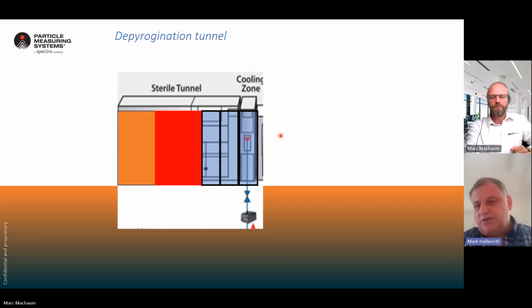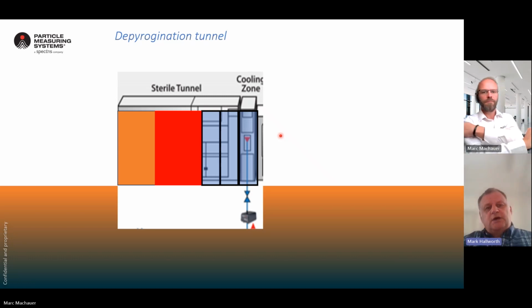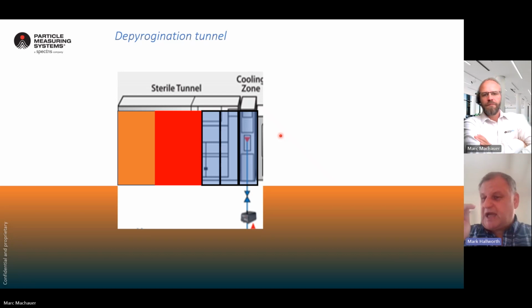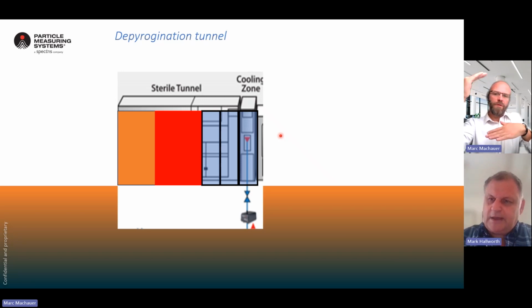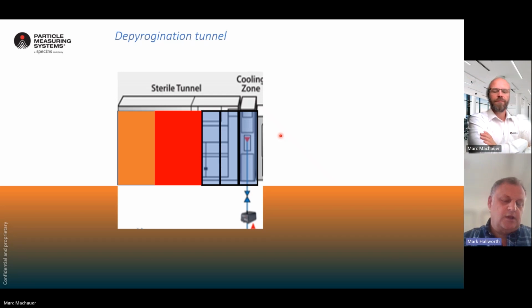Now, 2 meters wide, isokinetic probes. Boy, if these tunnels are really shallow, i.e. they have a low ceiling. I mean, what would be a typical height for a tunnel? The exposed area in the middle where the glassware is, maybe a foot. Yeah, 30 centimeters. 30 centimeters, 300 millimeters if we want to be precise and German about it, Mark.